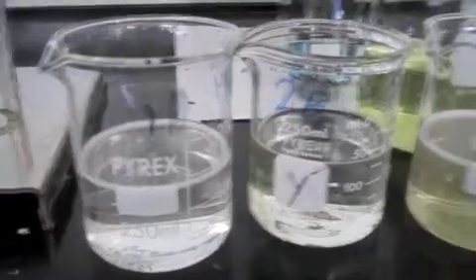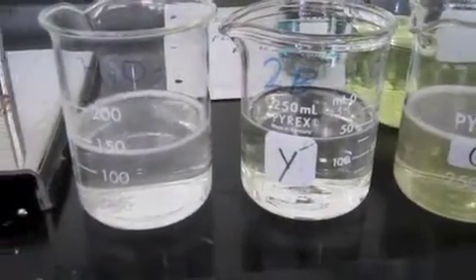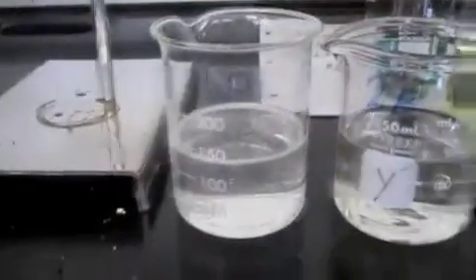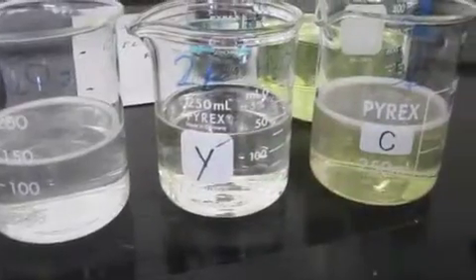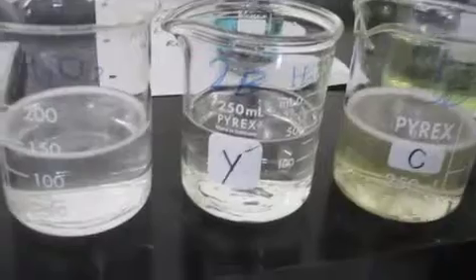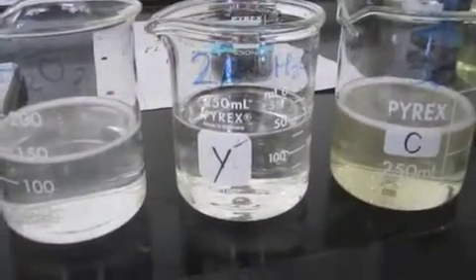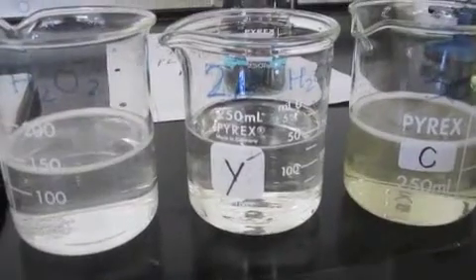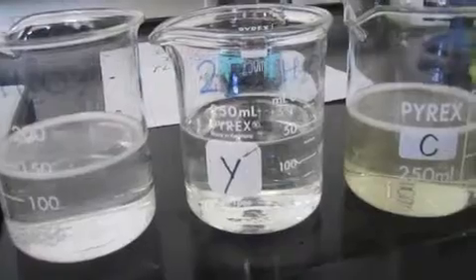Okay, so we've seen that these are beakers for our hydrogen peroxide, and this is the beaker that was used for after 1 minute, 5 minutes, and 20 minutes. And you can see a difference in the color of the beaker, this being the lightest and this being the darkest. So we think that this shows that after 20 minutes, the most color was taken out of the flower, which is why the bleach is actually darker in color than the other two.